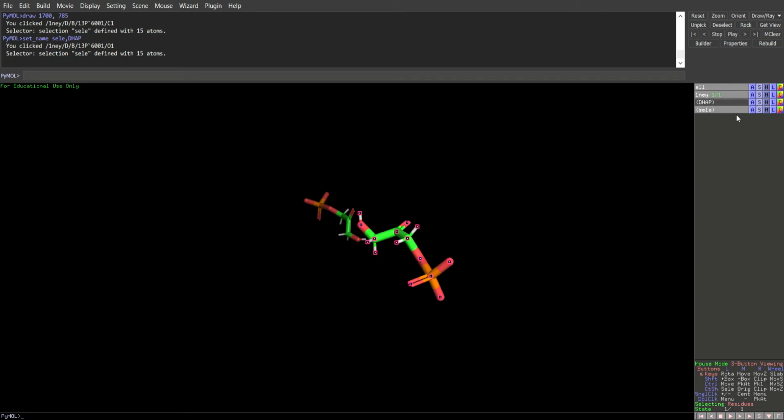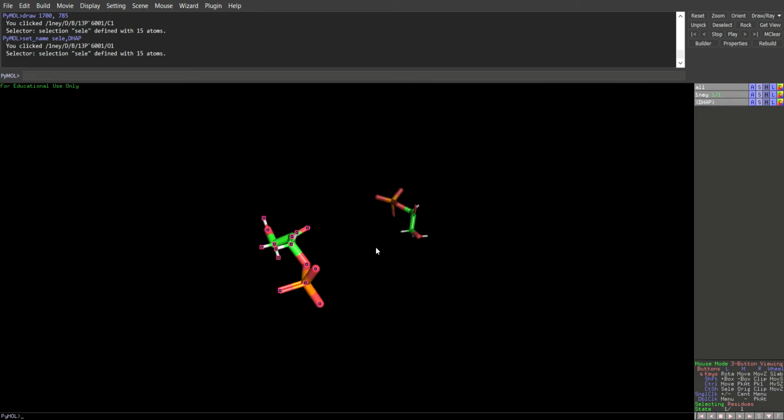Next thing you want to do is see if you click this, it makes a selection here. I'm just going to ignore this one. Actually, what I'm going to do is delete that because I don't want that. So when you click one of these, it highlights it in red. That means it's highlighted. To remove the highlight, you click anywhere else on the screen that's not an amino acid, and it unhighlights it.